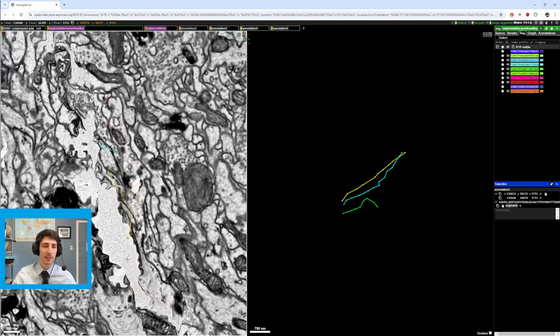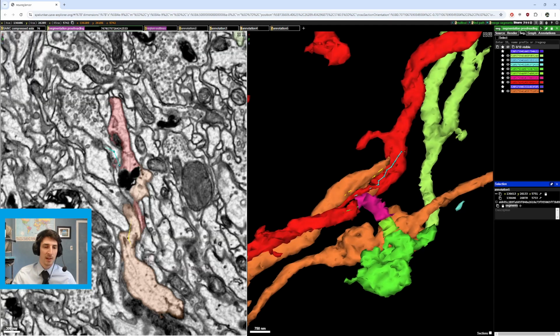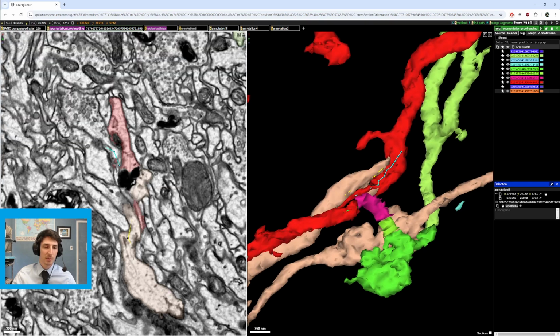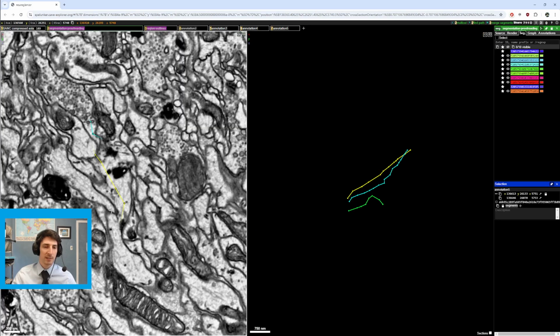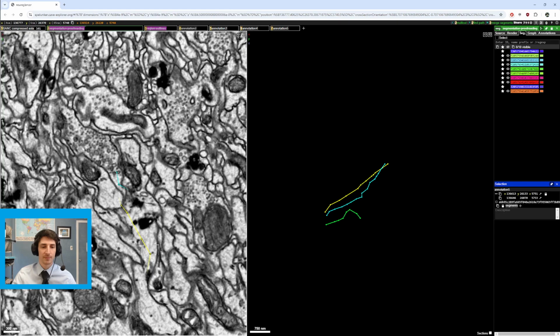Say we're doing the yellow one first. That's pretty difficult to see, but this shape you keep in your head. You go through one terrible slice, and that shape is still kind of here. Instead of following it through the torn area, you can follow it through the larger, more seeable, thicker area, instead of this thin area, which would be a little bit difficult. But sometimes if you go through the slice and say, okay, this is the same as this, then I know that if this connects to this, that is probably also the same.